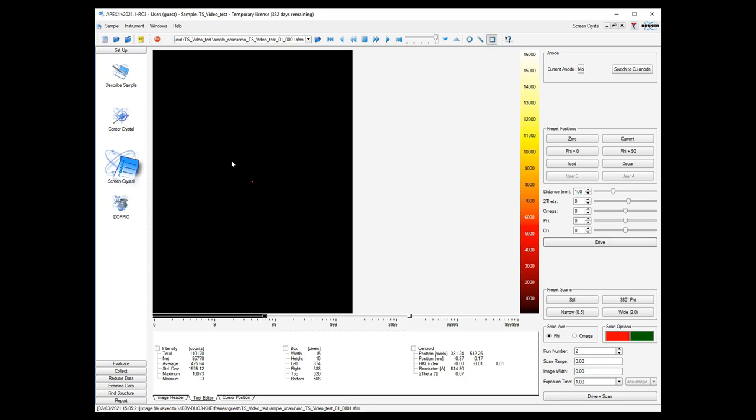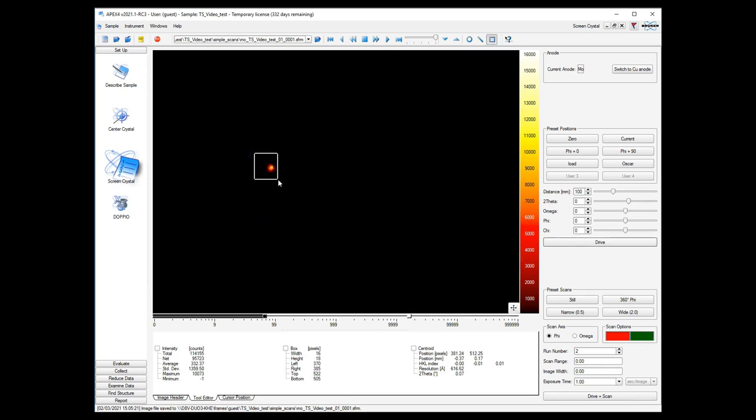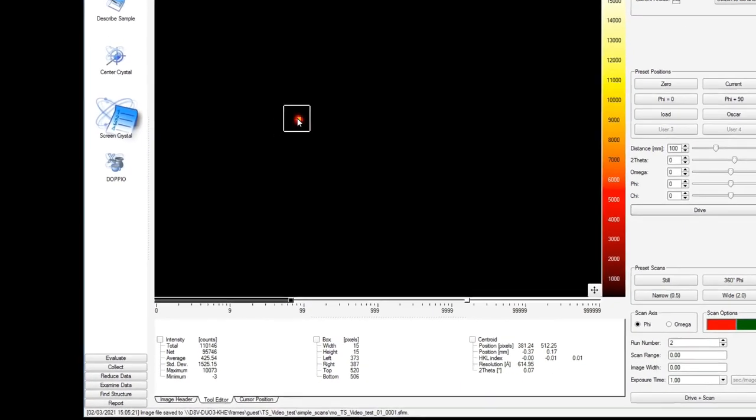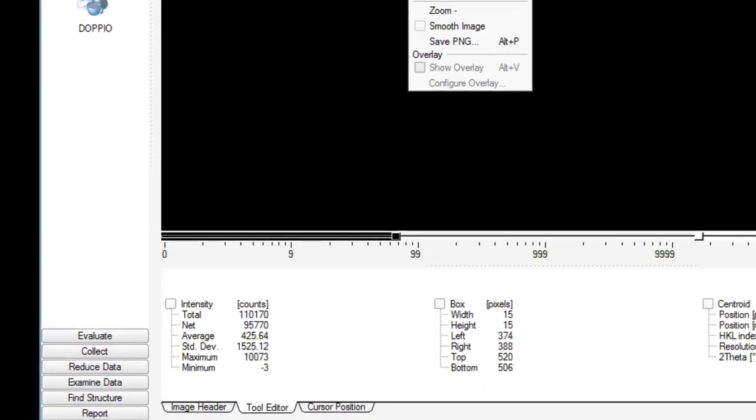So let's have a look at the results of our three experiments. First of all let's zoom in a little bit. What we want to do now is we want to integrate the intensity of this bright spot.